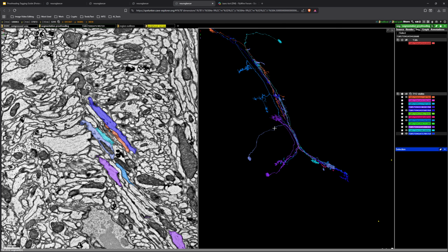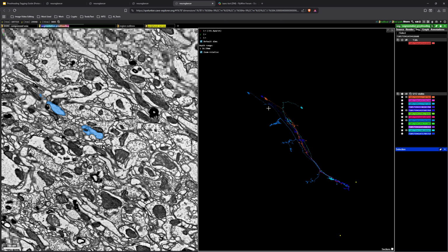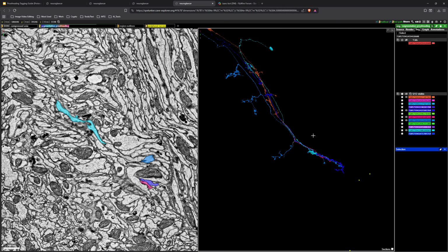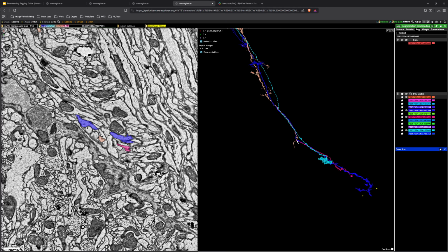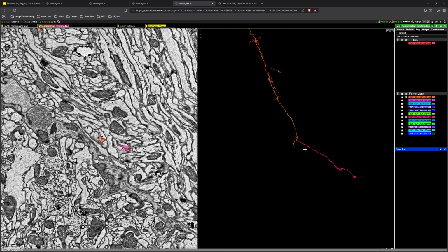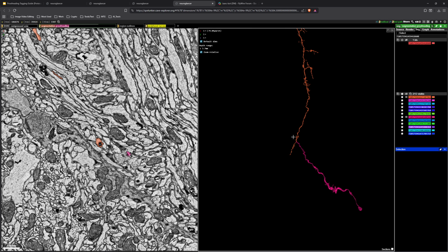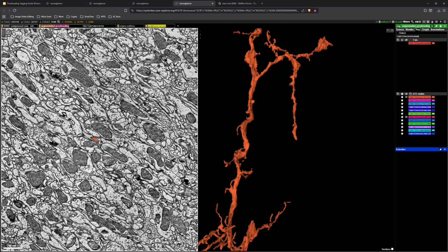So we can get rid of the cells here that do not look similar to our cell. Here we have a TMY cell. I think they call it a Y because of this sort of Y shape at the bottom. So it's transmedullary, and then it's like a Y. And our cell has this thing, right? So possibly, I think I just got rid of the correct trace. We are a TMY cell. So with that assumption that we just made by selecting those other cells, let's investigate that.